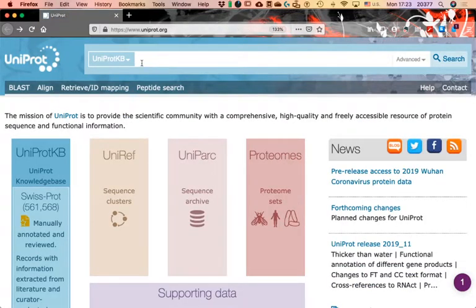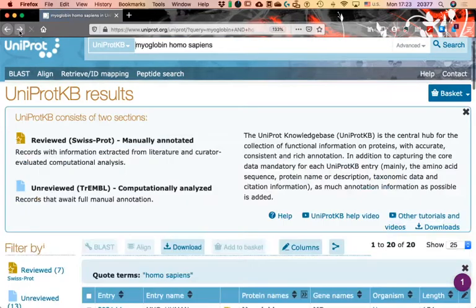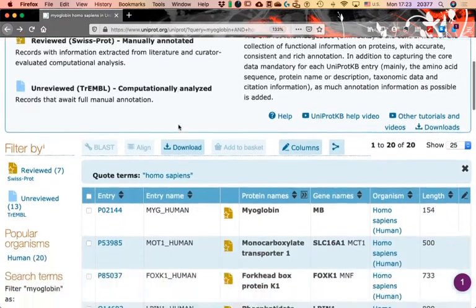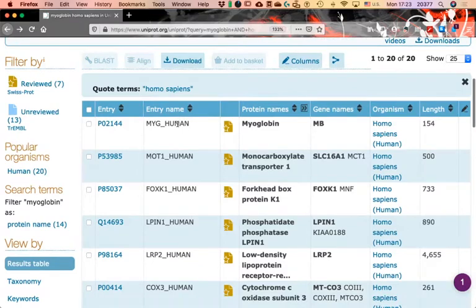Make sure you are on UniProt. Look up myoglobin in Homo sapiens, and now that you are on the results page, click on 'Columns.'